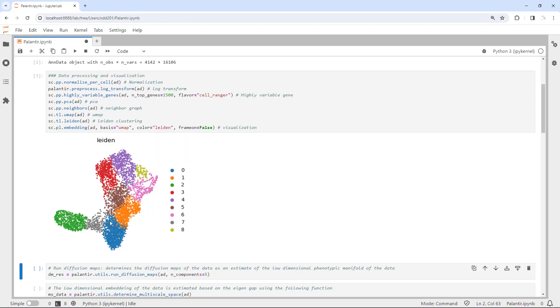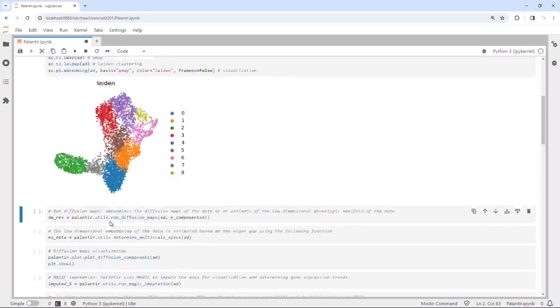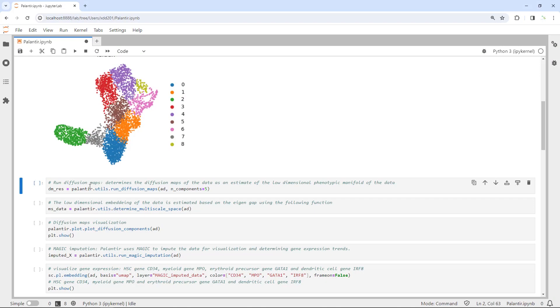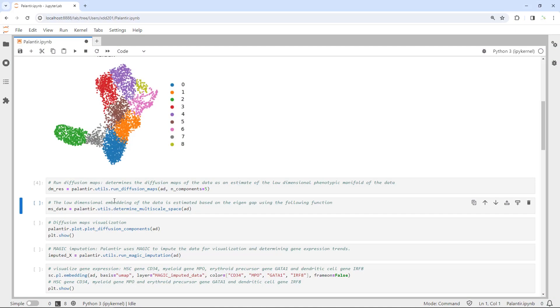Now we can prepare the data for Palantir package analysis. First, we need to run the diffusion map. If we run this function, it will determine the diffusion map of the data as an estimate of the low-dimensional phenotypic manifold of the data. We set the n_components as 5. Next, we can use the Determine Multiscale Space function to estimate the low-dimensional embedding based on the eigen gaps.